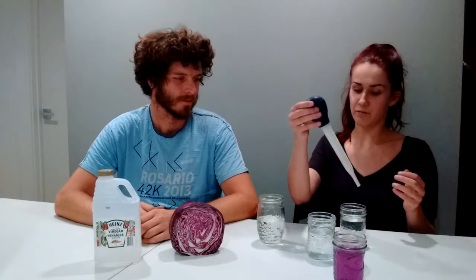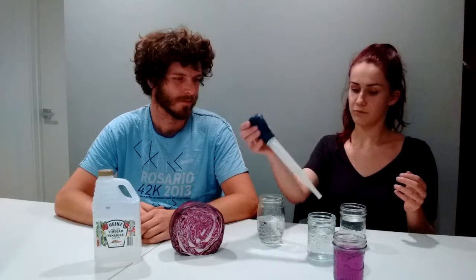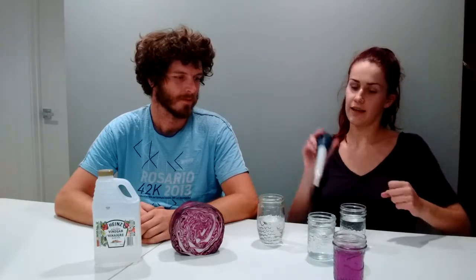What we want them to do is, usually I'll play music, and the kids will walk around while the music's playing. And once we stop the music, they'll have to do an exchange with one other student. So they'll pipette their liquid and put it into the other person's test tube. So they both do the pipette and do a transfer. And they have to note down who they've transferred with. Depending on the size of the group, if it's a class of about 20 kids, we'll do 3 transfers. But we've had homeschooling groups where it's maybe 10 kids, so then we do maybe 2 each.